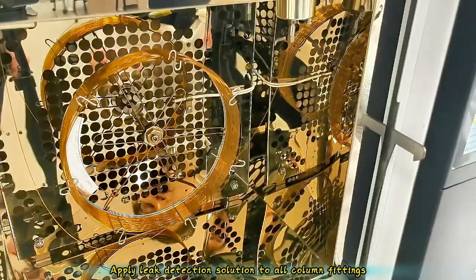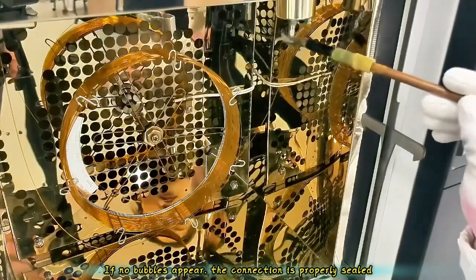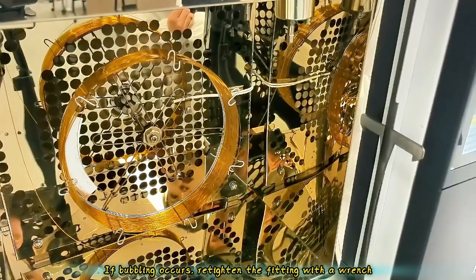Power on the instrument. Apply leak detection solution to all column fittings. Observe the fittings for bubble formation. If no bubbles appear, the connection is properly sealed. If bubbling occurs, retighten the fitting with a wrench.